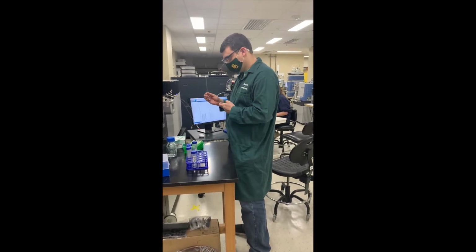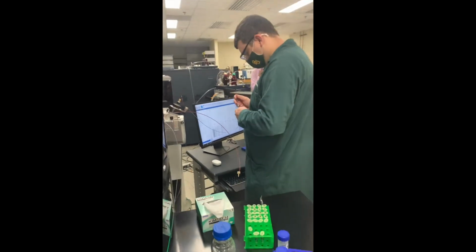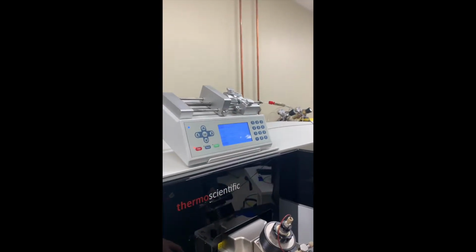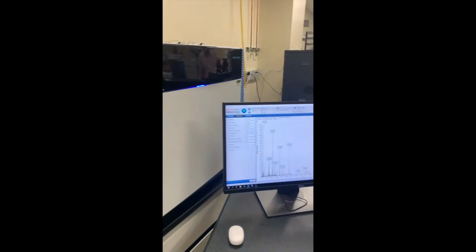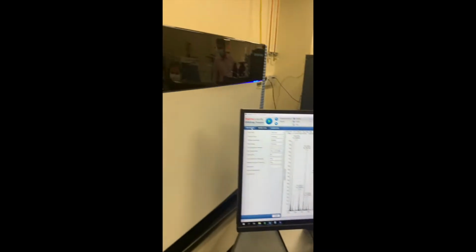I enjoy working in the Baylor Mass Spectrometry Center. I have the ability to run my own samples. For my project, I use direct injection to analyze metal-adducted carbohydrates and peptides. I use several novel fragmentation types available with the Orbitrap Fusion to create unique mass-to-charge values associated with a precursor mass-to-charge.